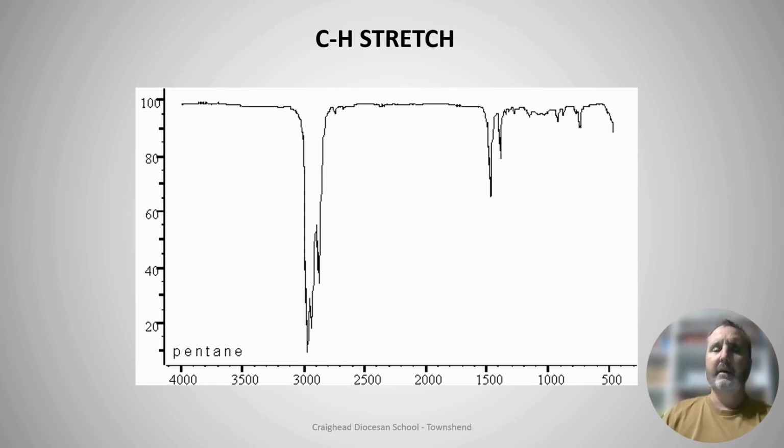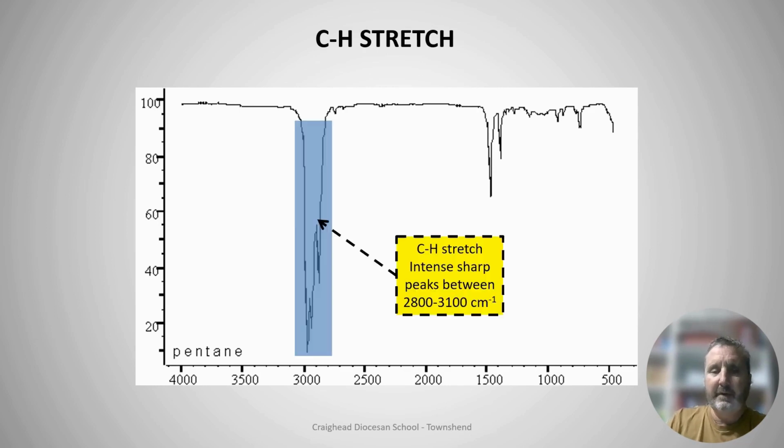So here we can see a CH stretch. A CH stretch happens here between 2,800 and 3,100. See here that this indicated blue section, this peak, is actually an absence of the light coming through. So it's like a big deep trough, but we call it a peak where you imagine it upside down. This sharp peak comes about from the carbon-hydrogen bonds stretching. And remember, they sucked that energy out of the light to make themselves move. And now when the light is measured, it's not there anymore.